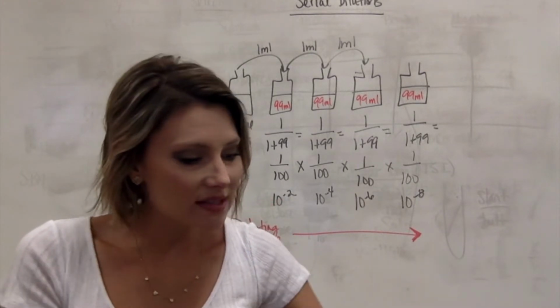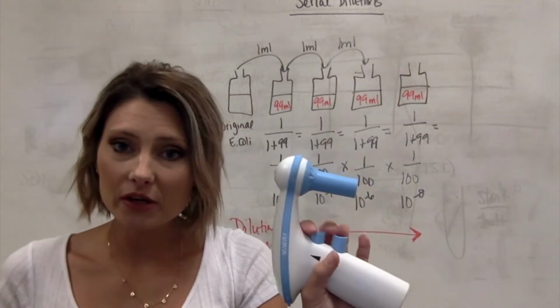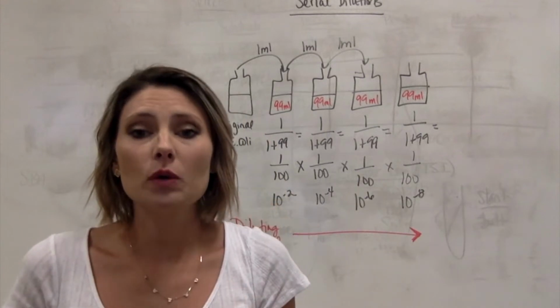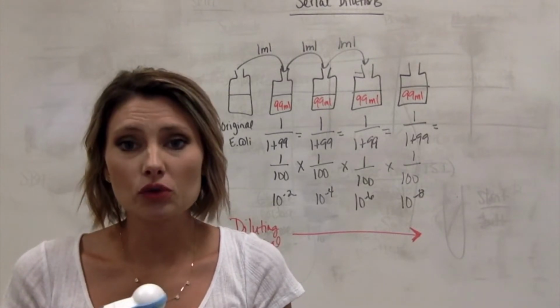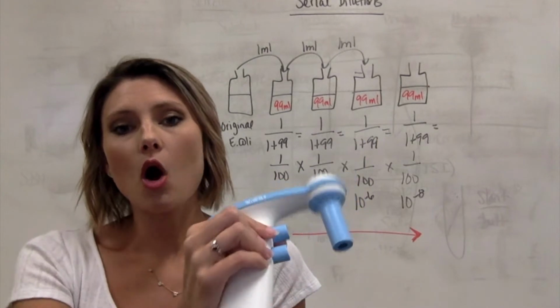We're also going to need a pipetter. So I have an automatic pipetter here that I'm using. If we were doing this in our actual lab, you would be using a manual pipetter, and that's where you have to roll it up, and it's a little bit more difficult to use, but since I'm the one that's doing it, I use my nice fancy automatic pipetter.